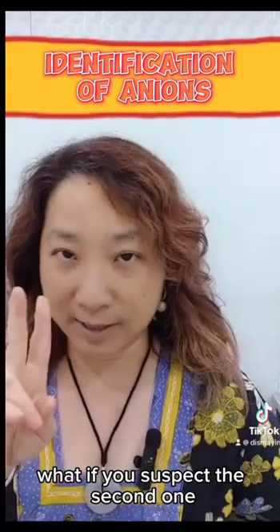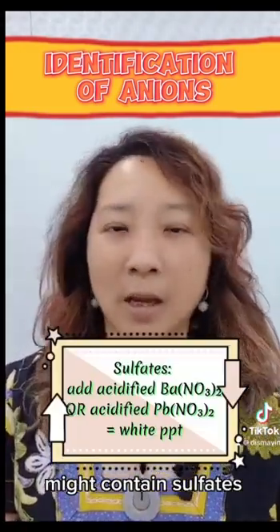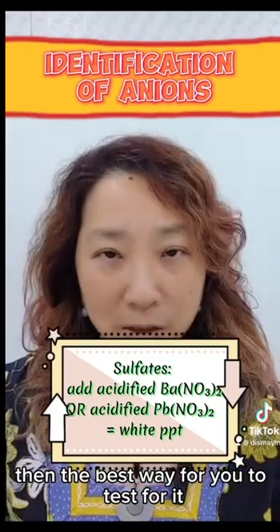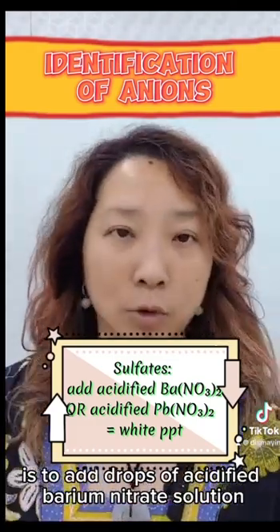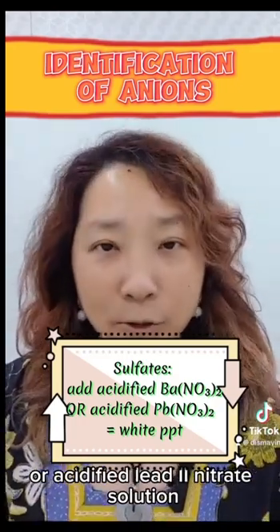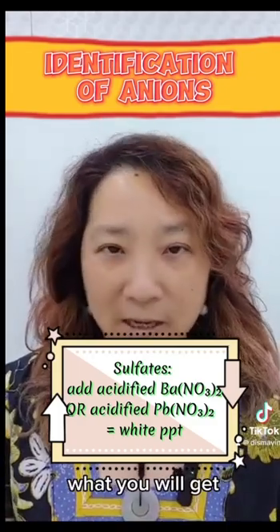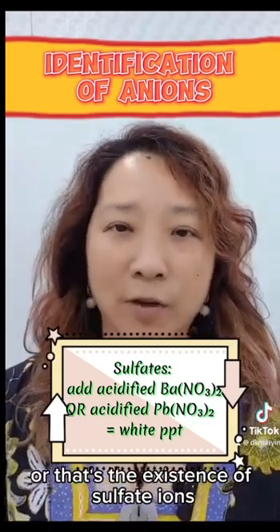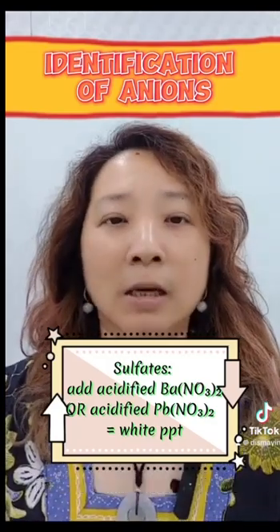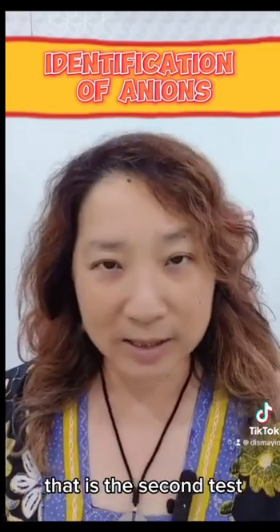What if you suspect, the second one, that the unknown solution possibly might contain sulfates? Then the best way for you to test for it is to add drops of acidified barium nitrate solution or acidified lead(II) nitrate solution. If there are sulfate ions in the unknown solution, then you will see the appearance of a white precipitate. That is the second test.